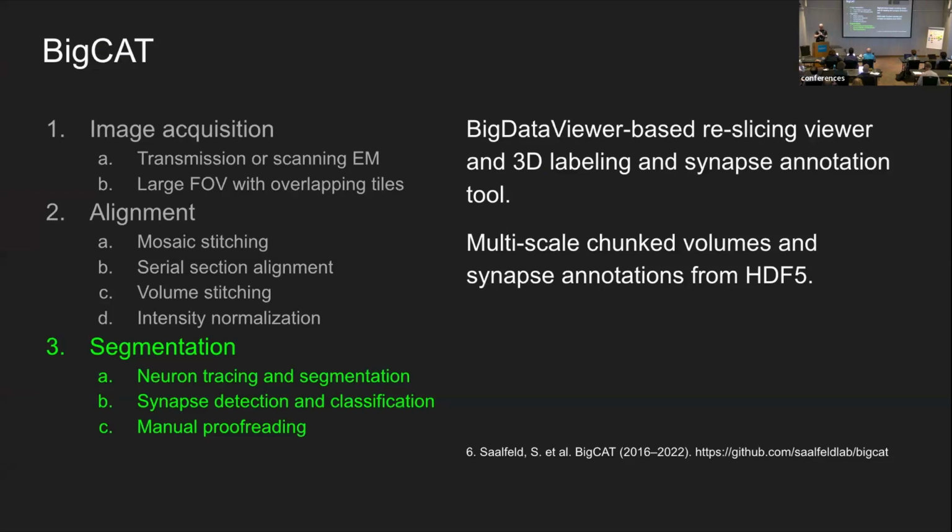Well, those were skeleton tracing tools, but of course, it would be nicer to have actual volumetric segmentation of these structures. One of the things that we learned over time is that we don't have enough training data to actually use proper deep learning tools. So we were interested in generating more and more comprehensive ground truth data. A lot of groups were doing similar things. Our ground truth data set at that point in time was eventually 5 times as big as all the previously existing ground truth data sets together. We're proud of the way we created this.